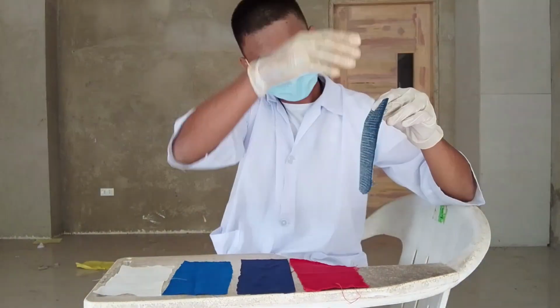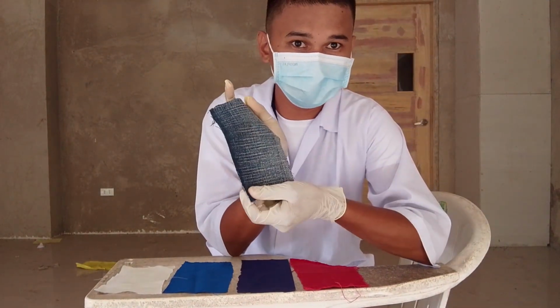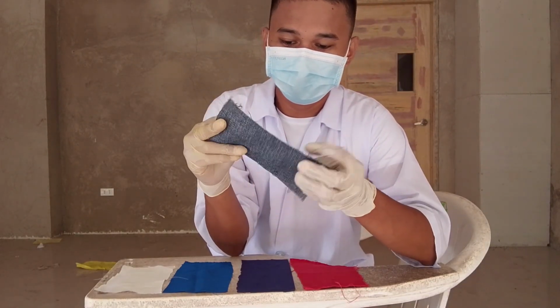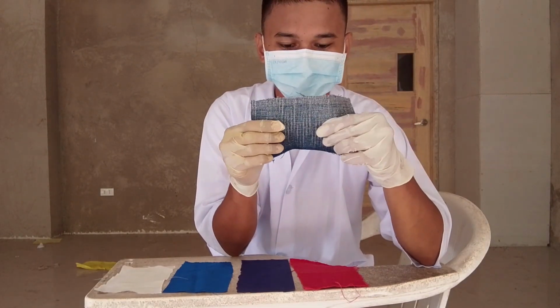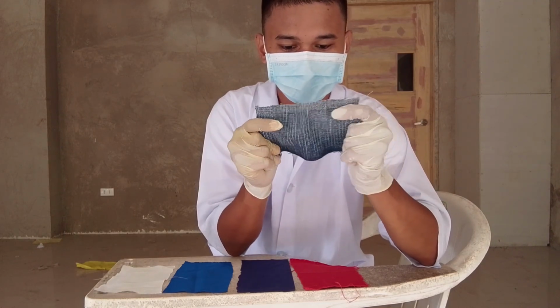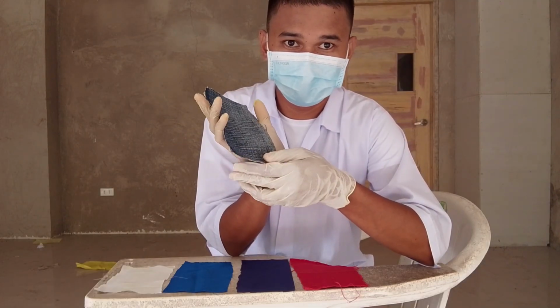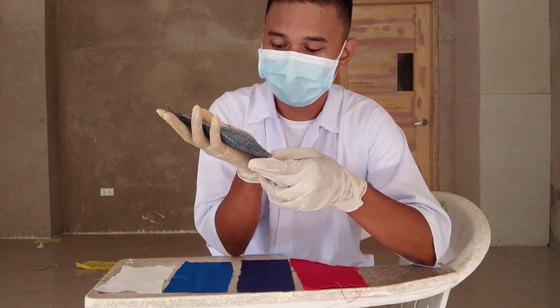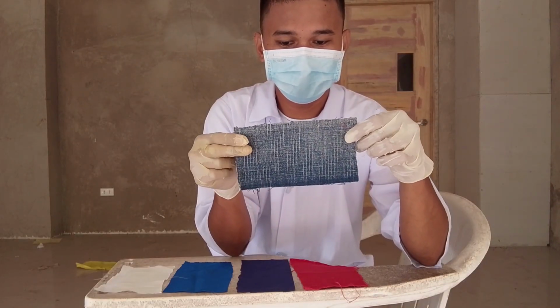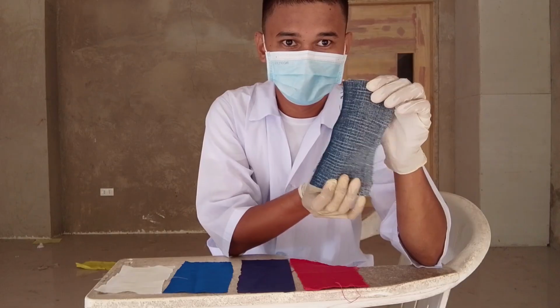For the old denim, the color is a mix of dark blue and warm white. The texture of this denim is hard, kind of hard, and the shape of this denim is rectangle. The size of this denim fiber is 3 by 6 inches. Next is cotton.